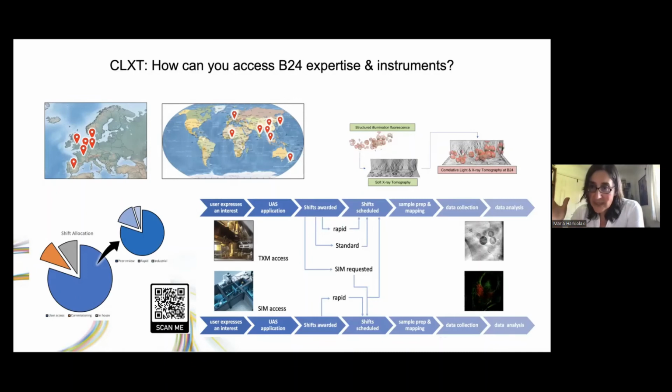to my knowledge, it hasn't been done yet because it shears, it's very, very difficult. I believe people have done 0.7 microns or something, so you can do a very thin slice, but you do need to sort of permeate the tissue. We've been trying. So in theory, if somebody could produce something that's 10 to 20 microns thick, we can do it.